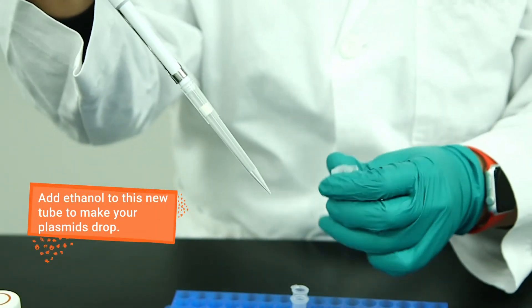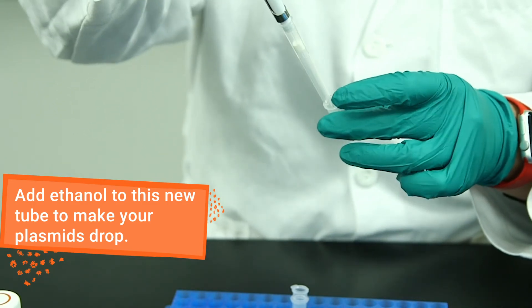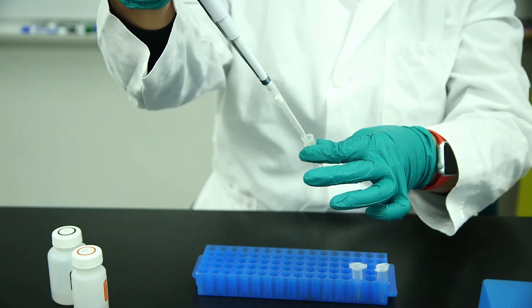Add ethanol to this tube to precipitate the plasmid DNA and either pellet the DNA by centrifuging again or transfer the sample to a DNA binding column.